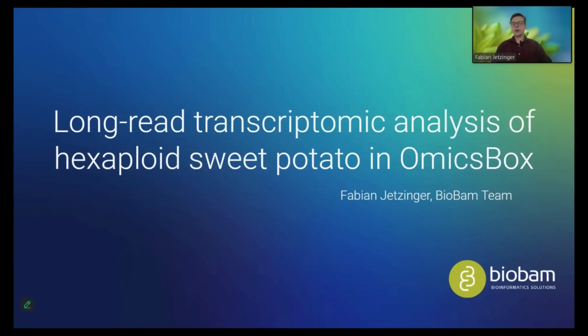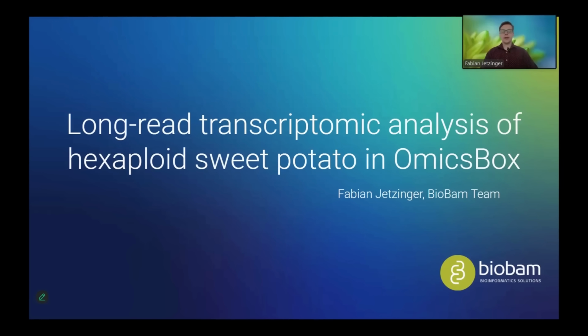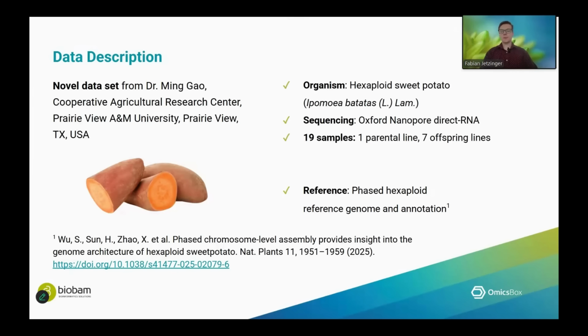And with that, we're ready to begin today's webinar on the long-read transcriptomic analysis of hexaploid sweet potato in OmicsBox. So the dataset that we will be analyzing today is actually novel data that comes to us from one of our collaborators, Dr. Mingao, at the Prairie View A&M University in Texas. Thank you very much for agreeing to let us use your data in this little showcase.